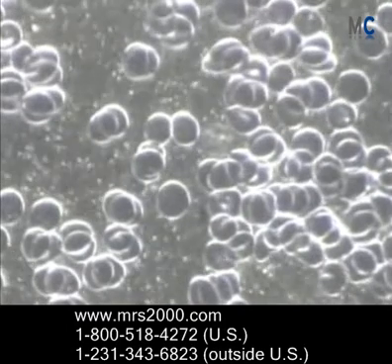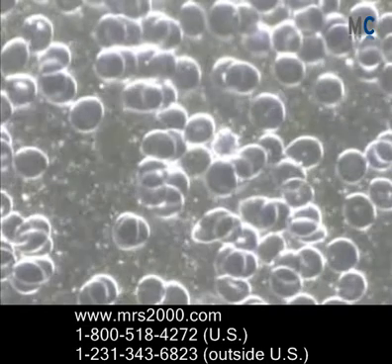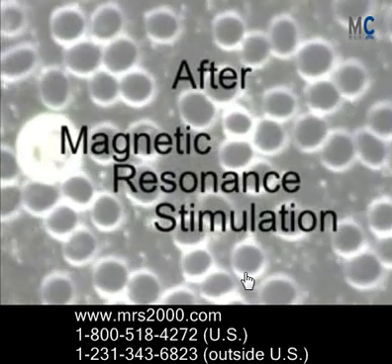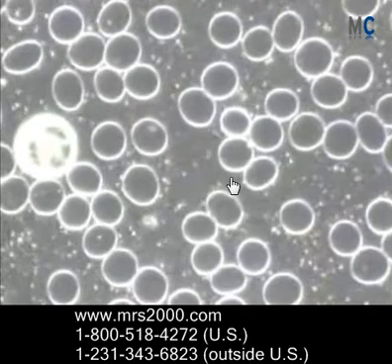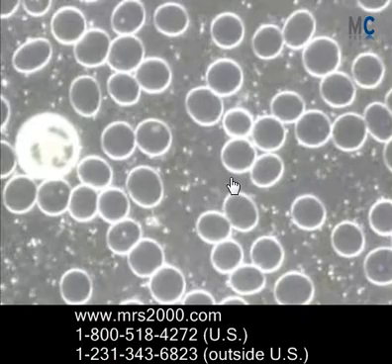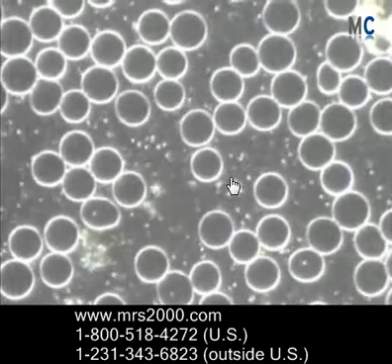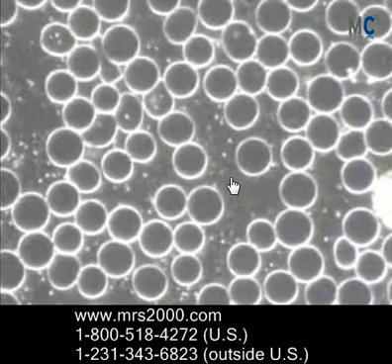Here we see somebody before — this is before MRS2000, or magnetic resonant stimulation — and notice that the red blood cells are kind of dark and stuck together. Now afterwards you can see just a very dramatic change. Notice the brightness of the cells, they're more spherical, there's more separation, which means the cells are going to help absorb oxygen and release it into the cells more effectively.